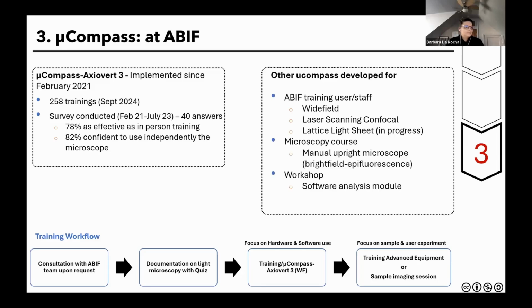We also developed the MicroCompass for other microscopes. We have one for the laser scanning confocal. I'm building one for the lattice light sheet that we have. We have also created some for microscopy courses, so MLMC, and also for workshops for software analysis. So you can really adapt it quite easily for whatever you want to teach.